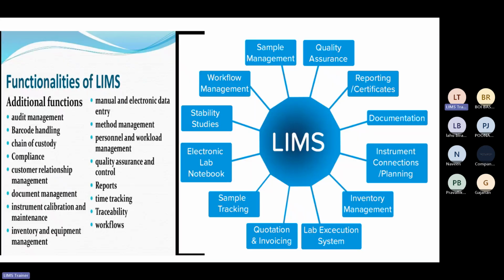Here some other functionalities are explained. See, sample management, quality assurance, reports, certificates, documentation. All this will be involved in the detailed course. I will explain each and every aspect related to the different functionalities provided by the LIMS software, and that also will be included in the sessions.